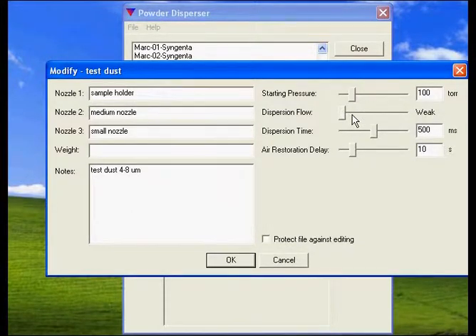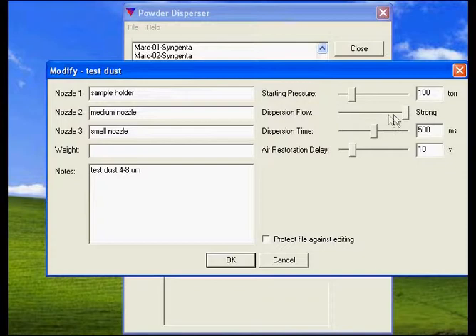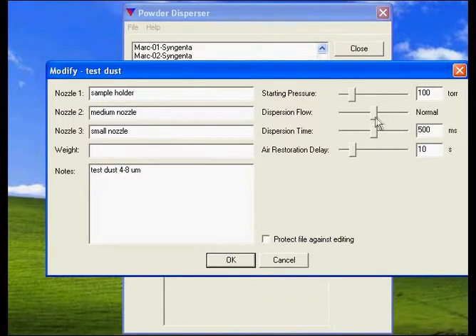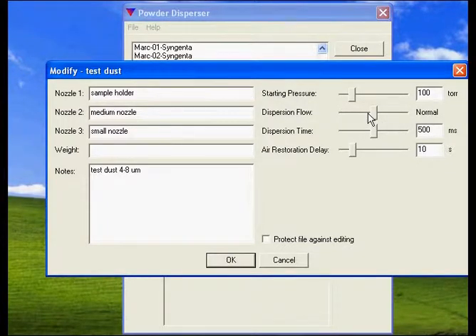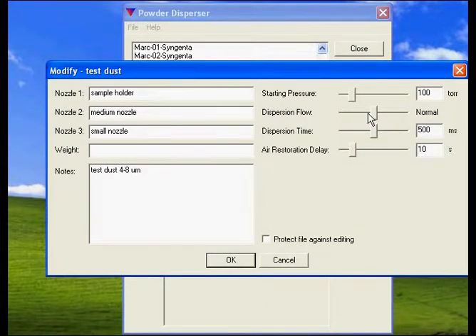Dispersion flow: you have the choice between weak, normal, or strong. This just determines which valves open up inside the system. I'll leave it on normal for this test.